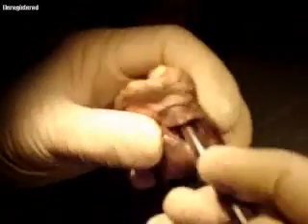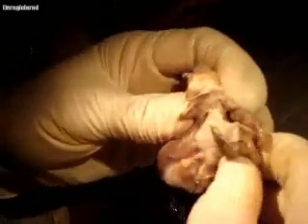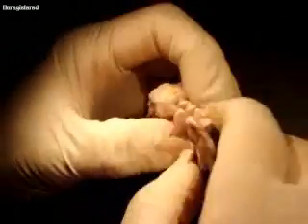If you follow that retina to where it's attached, which is right here, coming out of there, if we were to remove this, I'm not sure that I can. See if I can do it.